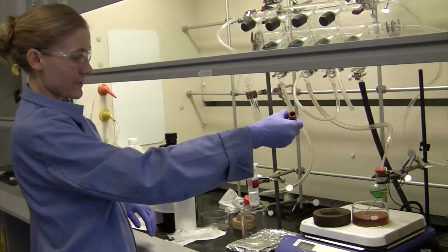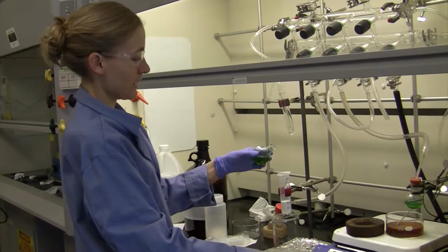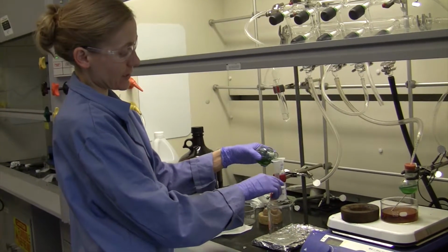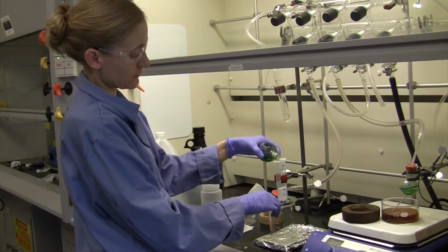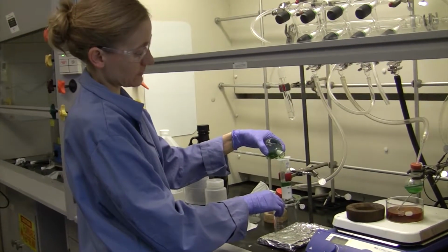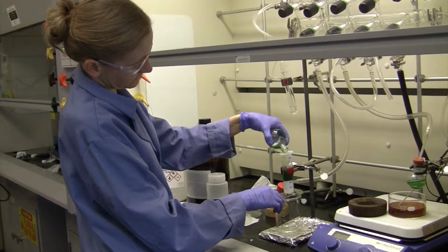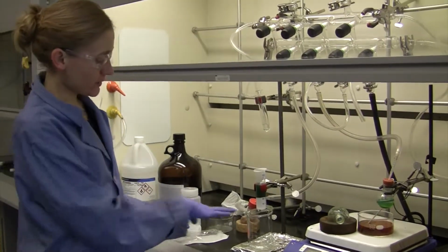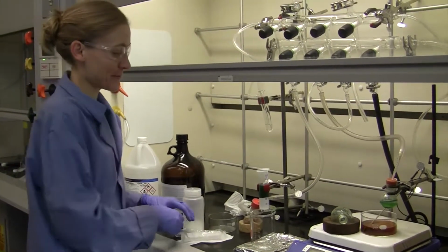Nice solution of polymer over here. All we do, uncap it, and very, very gently, so you don't disturb the surface, very gently pour this on. So here, you can see that by waiting for gravity, this column doesn't run very fast.